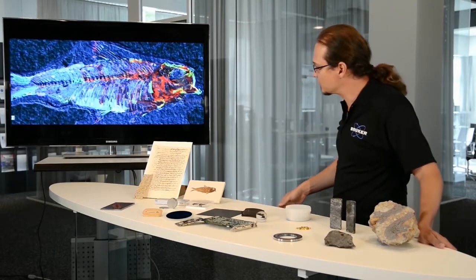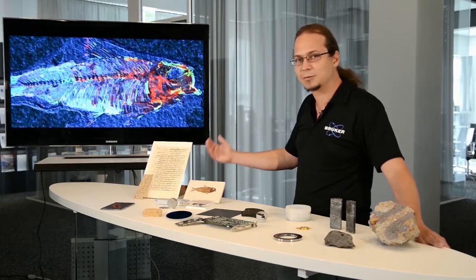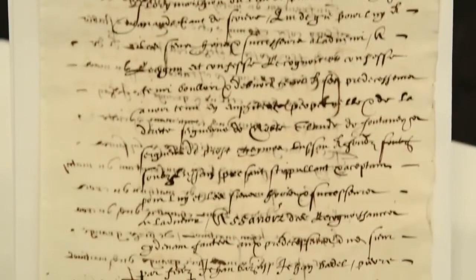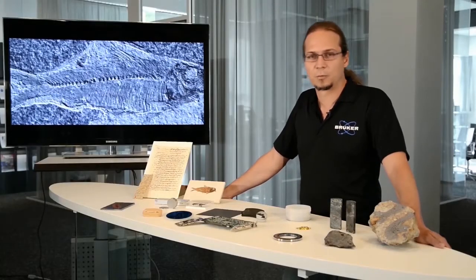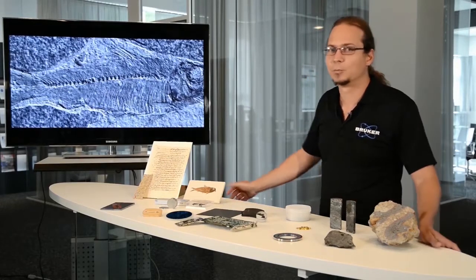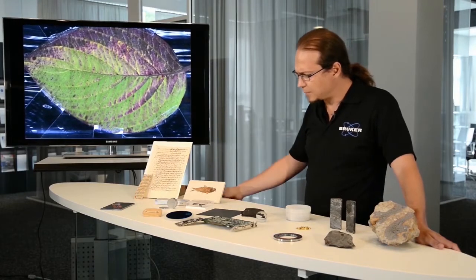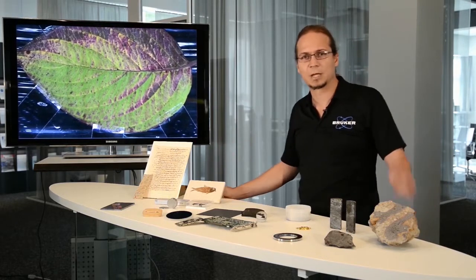Also, for some samples it is not possible to make any preparation, and you actually want to have the measurement as they are at the moment. We can determine the composition of the ink in the parchment or in the paper. Therefore, it's a technique which is quite interesting for forensic applications where the integrity of the sample after the measurement process is very important. On the table, we have a variety of applications, but just a small part of the samples we have measured over the last years.